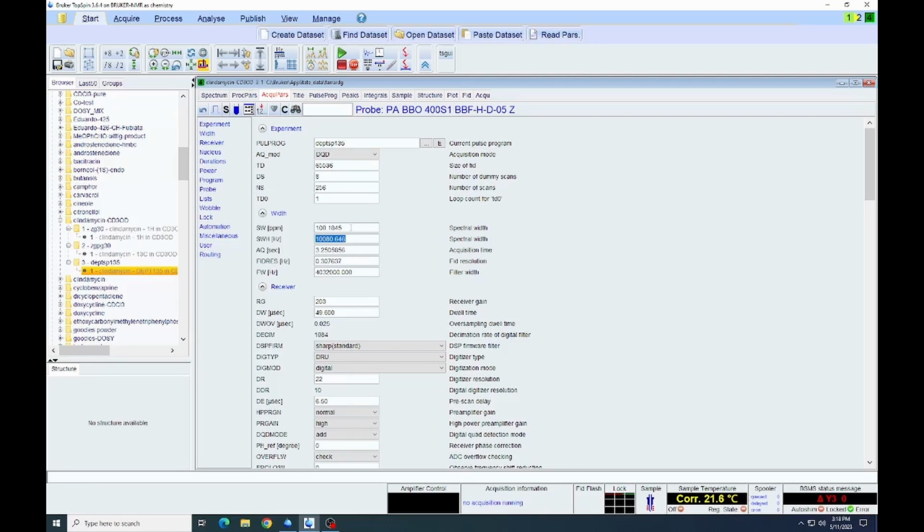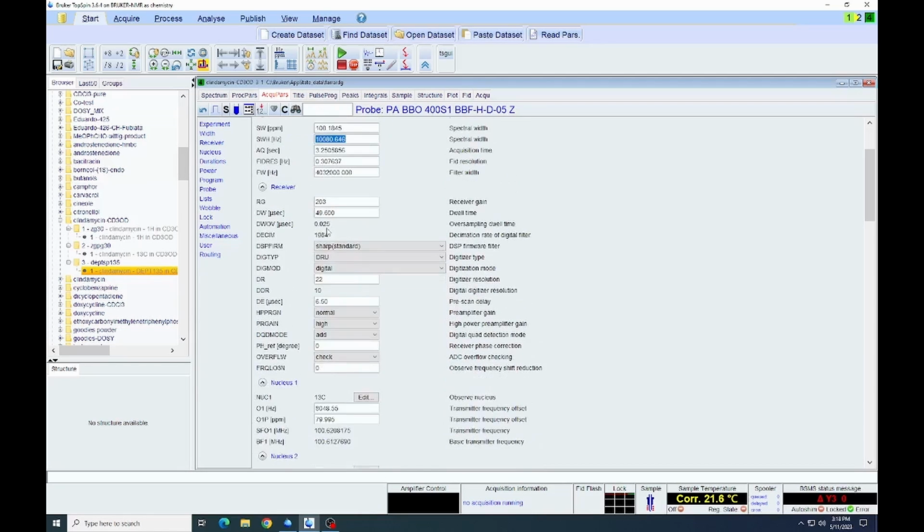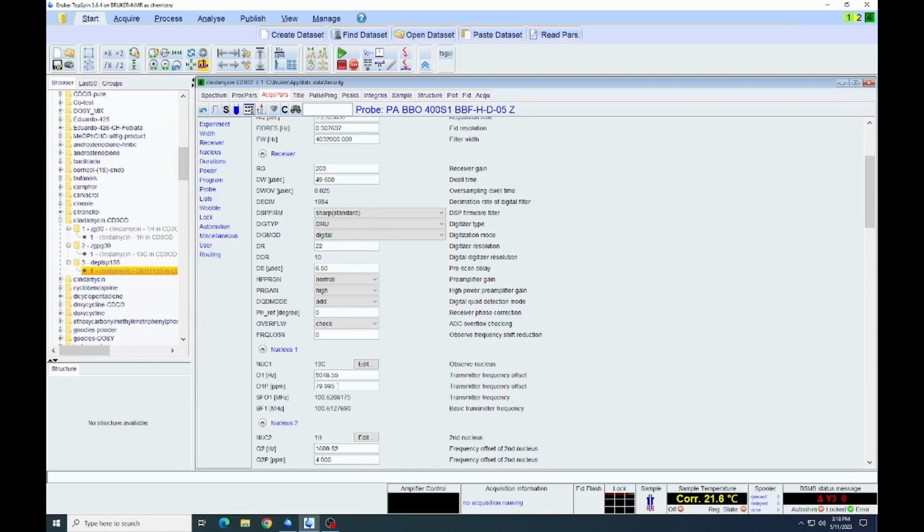And so we will scroll back down. And where we have the parameter O1P, that's the offset. And again, we want the ppm. We will change that to 50 to have that in the center of that range we're collecting. So we're doing 100 ppm centered at 50. So that would be from 0 to 100 ppm.